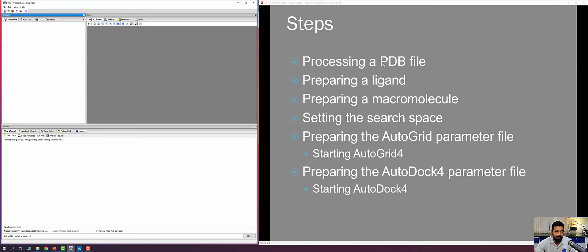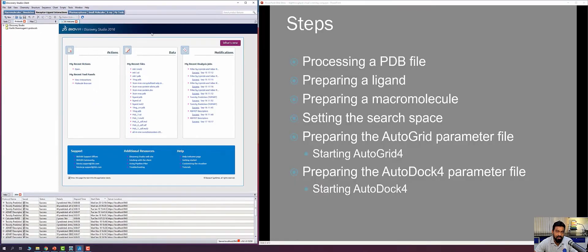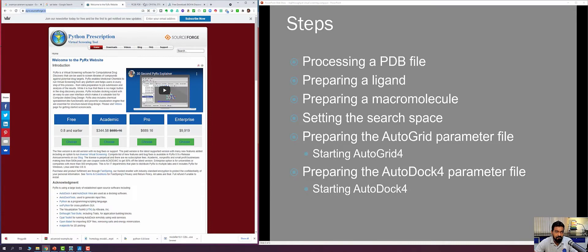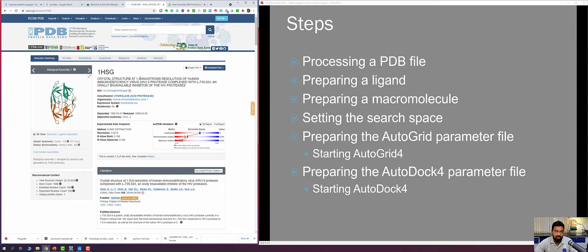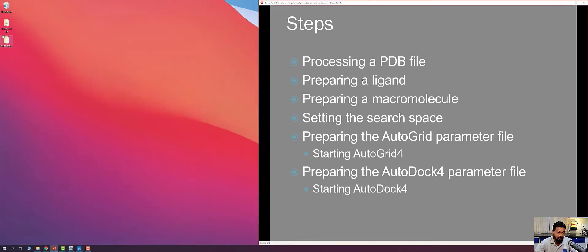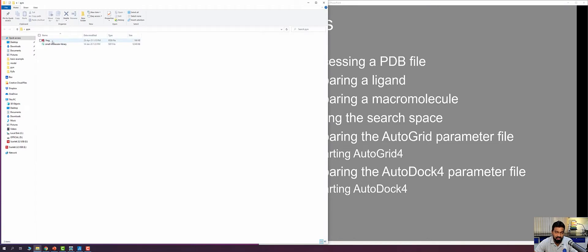The first step is to pre-process the PDB file using Discovery Studio Visualizer. For this example we are going to use 1HSG, the same protein molecule used for flexible and rigid docking. I have the needed files on the desktop in a folder called pyrex, which contains two files: 1HSG, the protein molecule complexed with the inhibitor indinavir, and a small molecule library that we are going to screen.